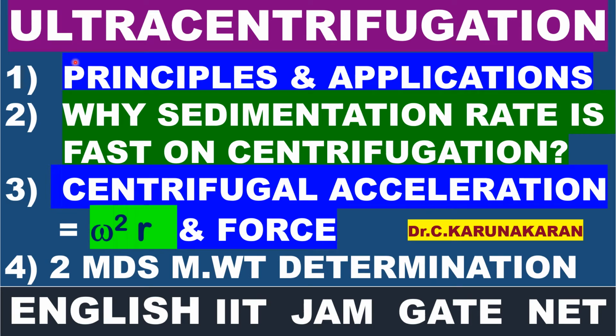Good morning. Let us study today the ultracentrifuge method. What is ultracentrifugation? We will also see the principles and applications of the ultracentrifugation method. Then, why is sedimentation very fast on rapid spinning of a sample in centrifugation? Because centrifugal acceleration is given by the formula omega square r, and centrifugal force.